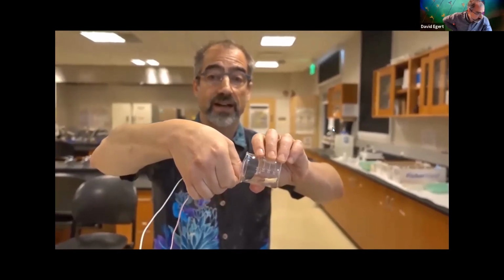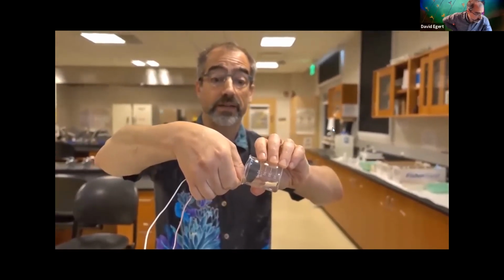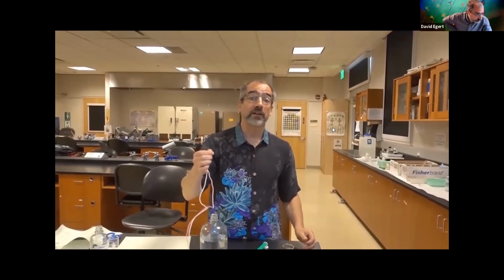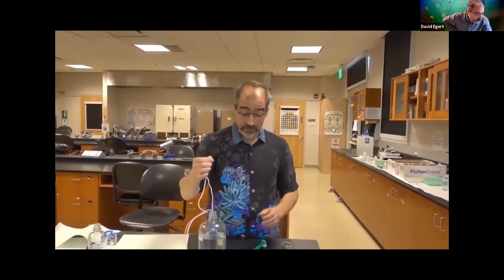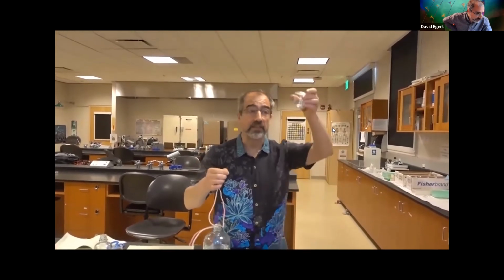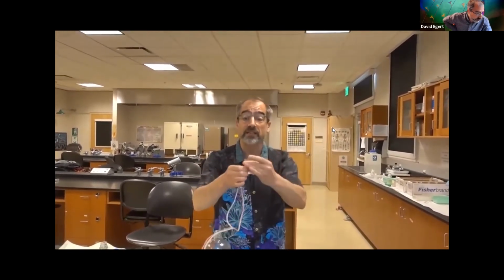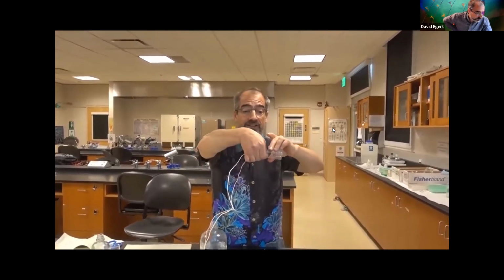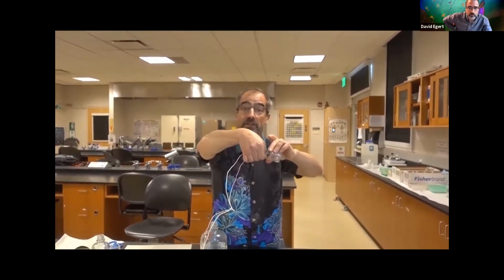And I don't hear anything. So that's telling me something about the electrical conduction of sugar water. And again, if you remember, with the sodium chloride, it looks physically exactly the same. But if I put the wires in there, it's a very different response.